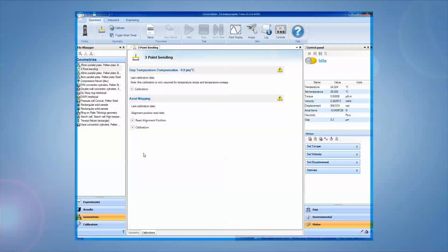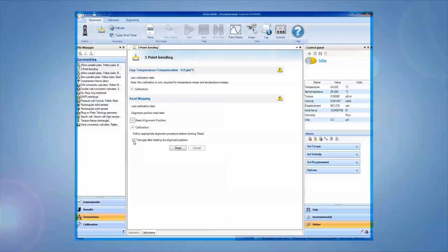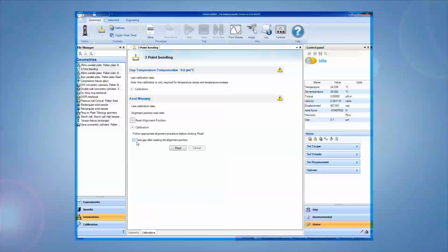Use the Trios software to read the alignment position through the geometry's calibrations. You can also choose to have the instrument tear the gap during the calibration. Tearing the gap sets the current position as the zero point.